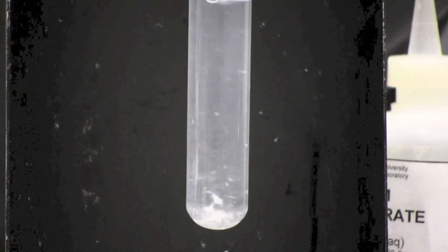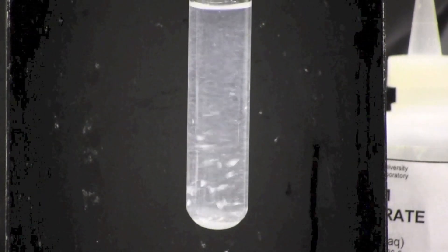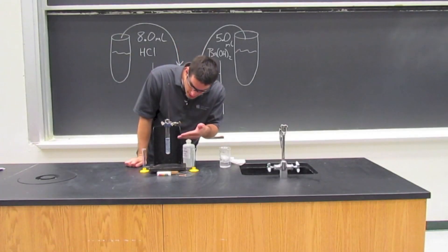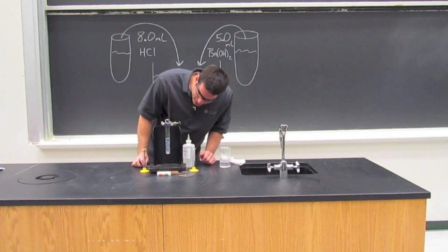As you can see in this tube, a white precipitate is going to form. If we centrifuge this out, it would fall to the bottom of the test tube.